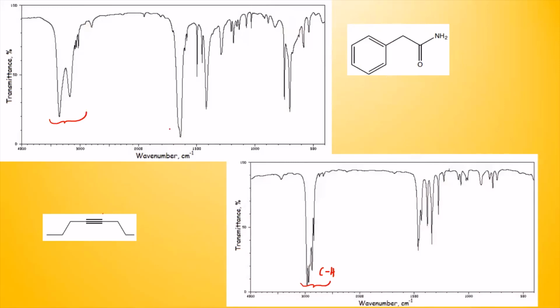both have CH stretching. And this, folks, I think this is the NH stretching. If you see, it's not the C triple bond C CH stretch, right? It's not the CH stretch because that's just 3300. There's no two peaks, right? The NH stretch is the one that's two peaks, 3500 to 3350, right? So this corresponds to that, but then the real giveaway is this. This is a C double bond O, which is around 1700, which is what is found here. So this is the NH stretch, okay, which is a strong peak.